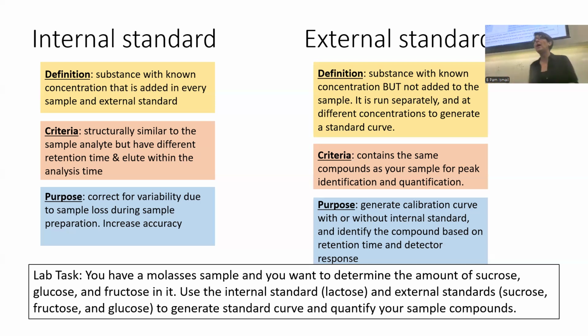So can you quantify without external standards? No. Can you be super accurate without an internal standard? No, especially if you have tedious sample preparation. So each one of those has a specific function. You cannot just use an internal standard and then quantitate. No. So you need both to quantitate and if you want to enhance accuracy. Sometimes sample preparation is easy, you don't need an internal standard.